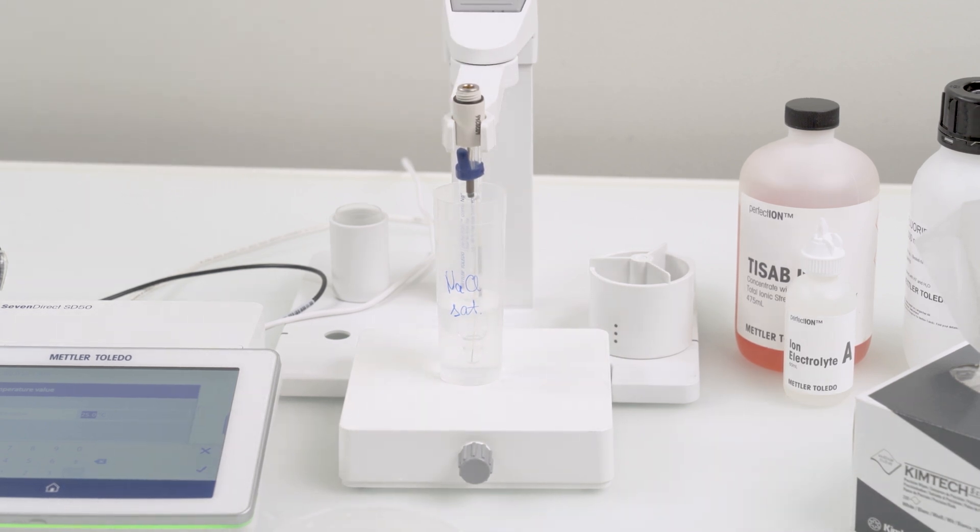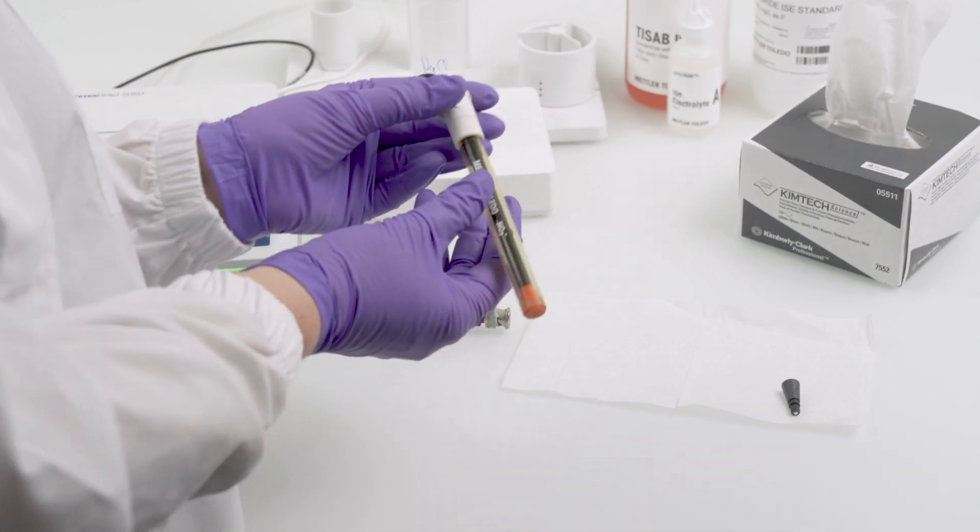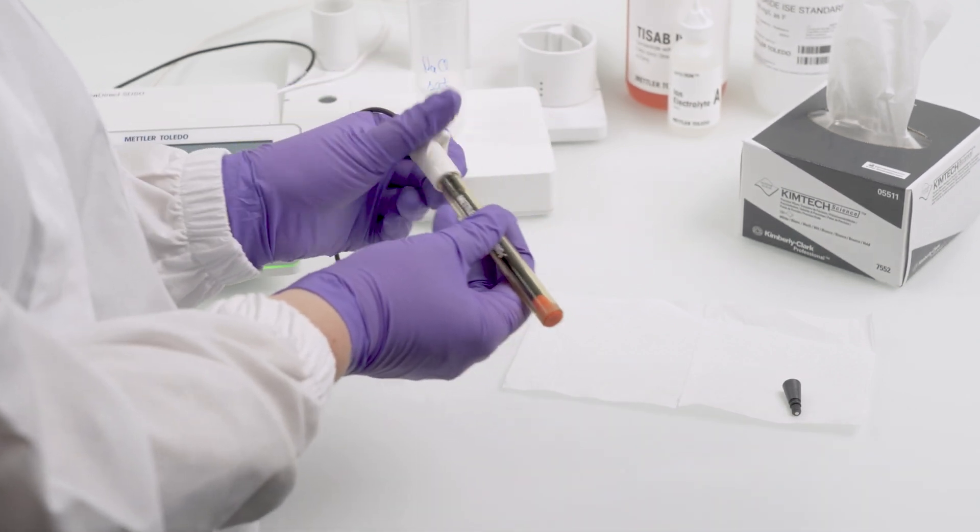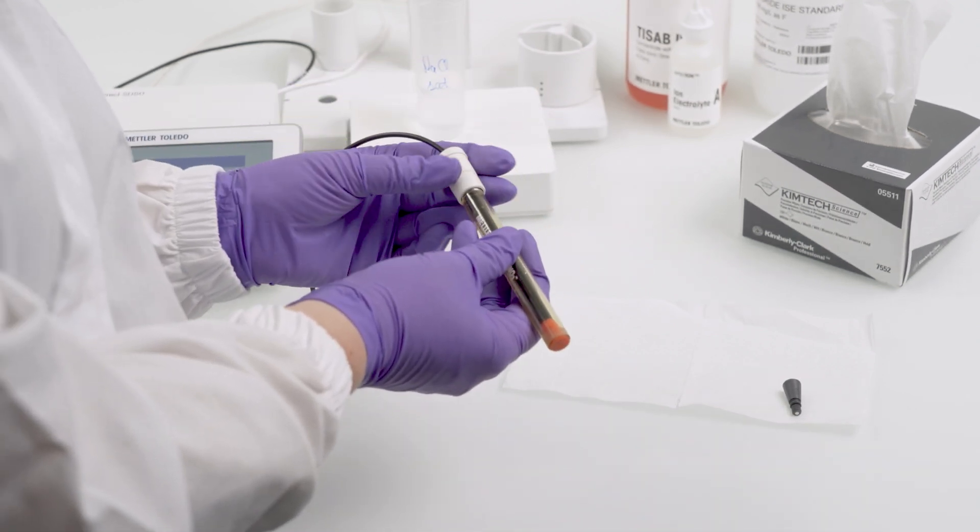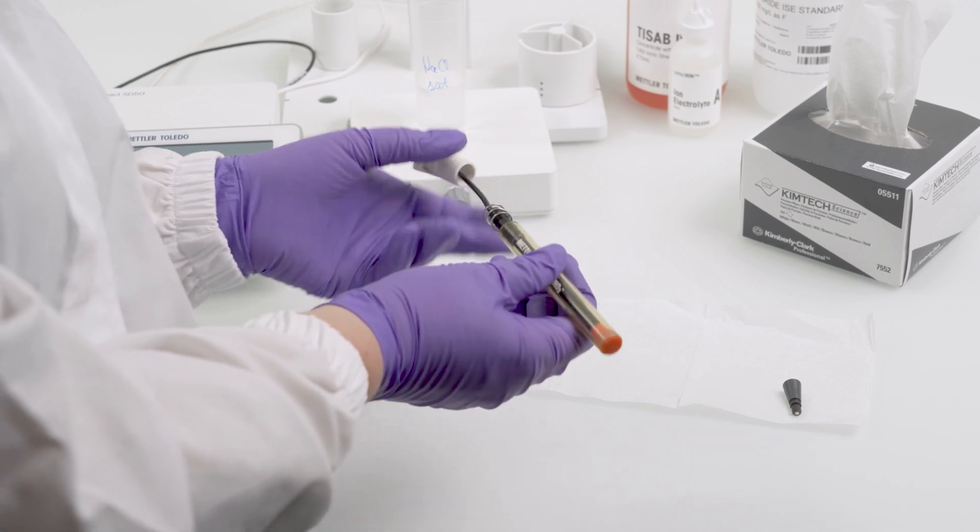After regeneration, always perform a calibration. If the calibration is still unsuccessful, consider replacing the membrane instead of buying a new electrode. Replacing the membrane is a less costly option that could fix the problem.